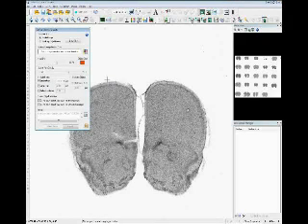There are a number of options that you can select. And basically what you do is you play around with each of these settings until it provides the resolution that you need for your data collection. I've already created a preset, which is I've already determined what I need in order to identify the boundaries of each section. And I'll select it.